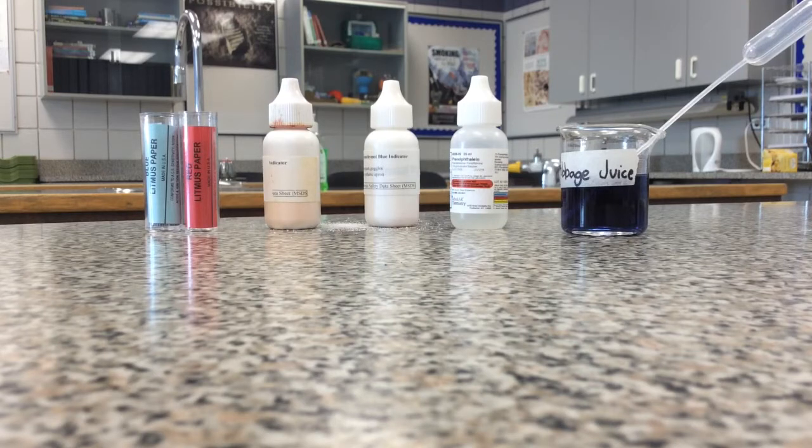Now, in order to know if something is an acid or a base, if we have a random liquid that we find somewhere, we may want to test to find out which one it is. You can do that using a lot of different indicators. In the notes, we talked about 4 or 5 different ones, and we will be testing them today to see how they work in real life.